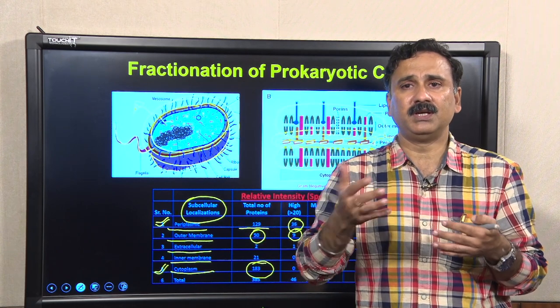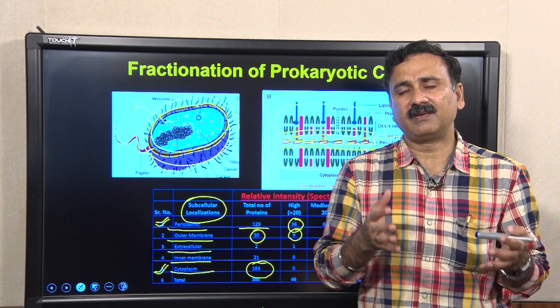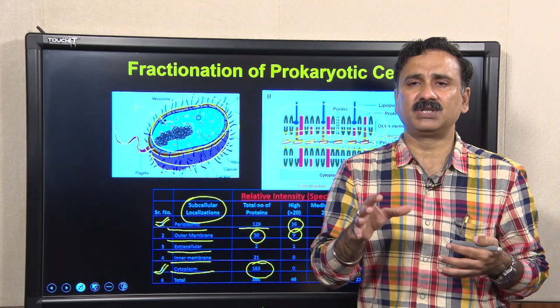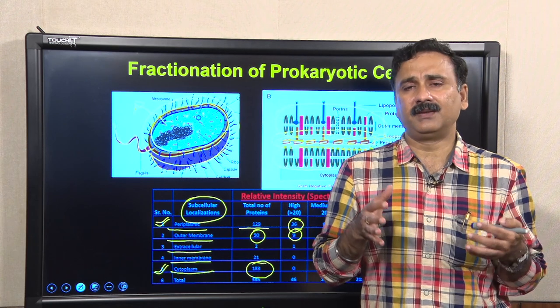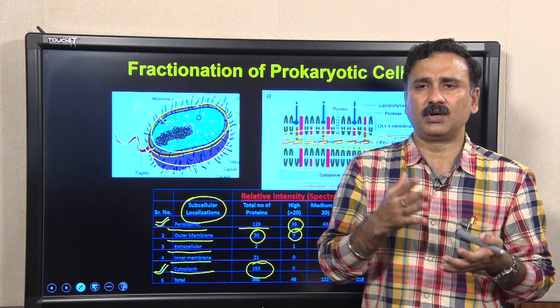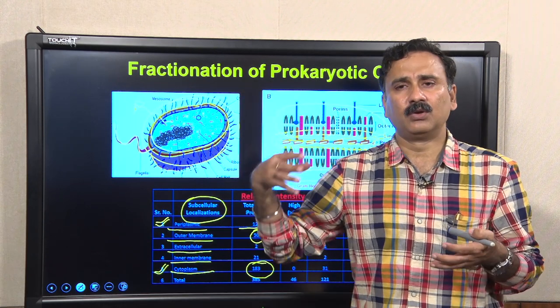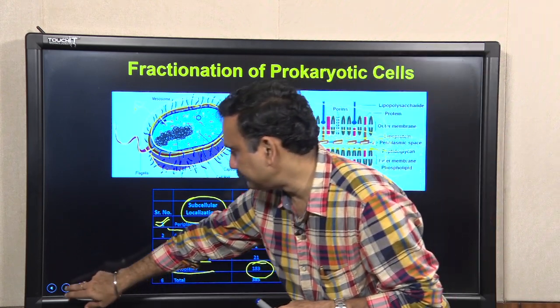Sometimes they also use the proteins to even sequester the drugs and related complexes. And the periplasmic fraction is very important even in, suppose you would like to use the bacteria for overexpression purposes, because the periplasmic fraction is giving a suitable environment for the proper folding of the protein. So in some cases, what happens is that you are actually putting a signaling sequence, or a localization sequence, into your protein of interest, and as a result the protein is getting into the periplasmic fraction. So let's see how you can isolate the periplasmic fraction from the bacteria.